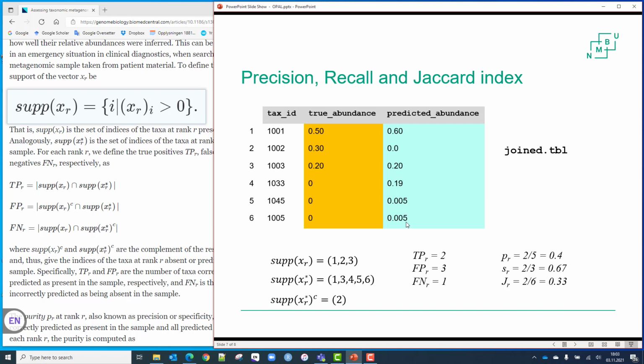I would say that when you have these low abundances, these taxa are hardly present in my data. This could easily be due to some noise here, right? The reads have been misclassified into these two taxa. A few reads only. So when the abundances are this low, I could easily call this absent.